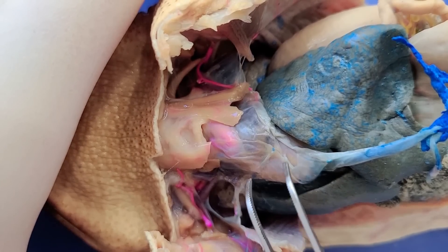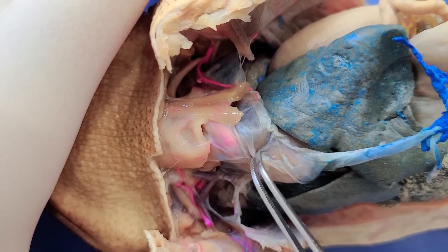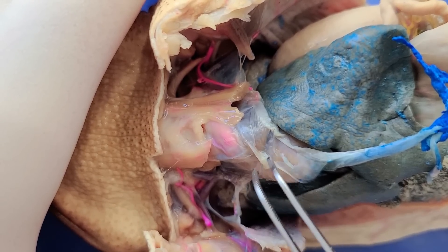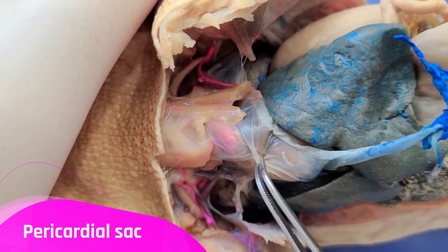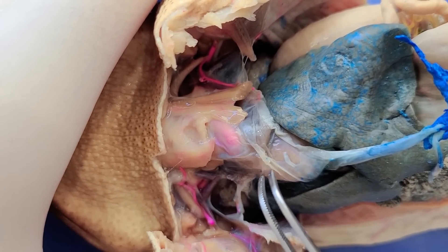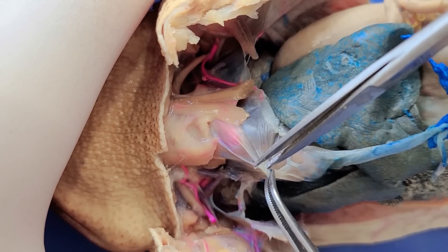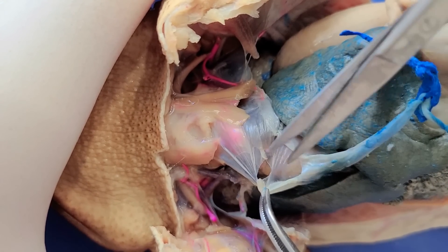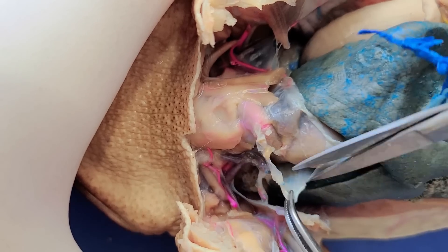Now above the liver is the heart. The heart is surrounded by this shiny, smooth membranous sac called the pericardial sac. It basically gives the heart its own room so it can pump without a lot of friction or bumping against other structures. Now I'll cut open the pericardial sac so we can see the heart better.